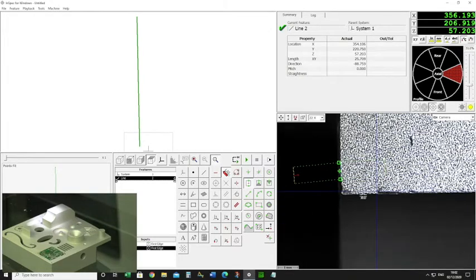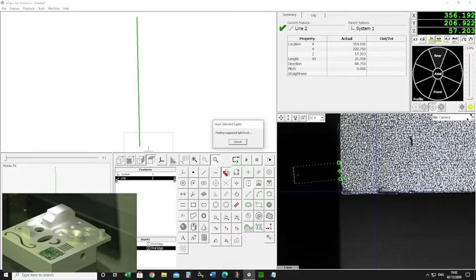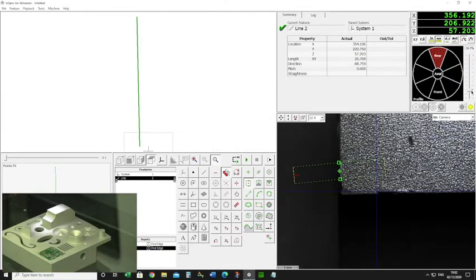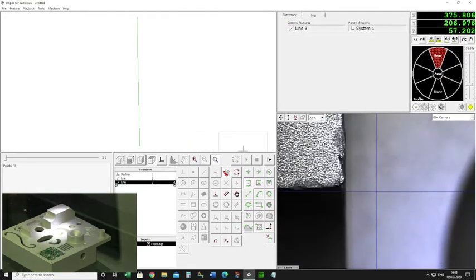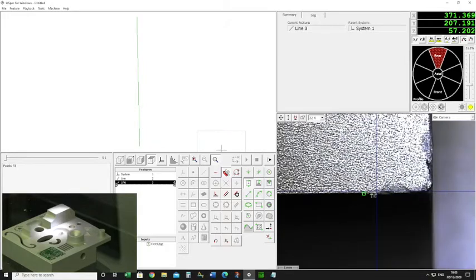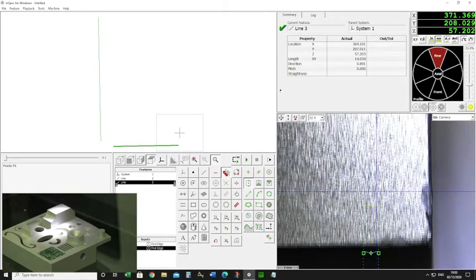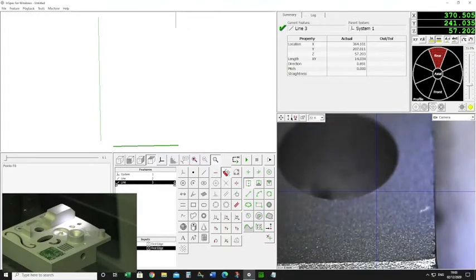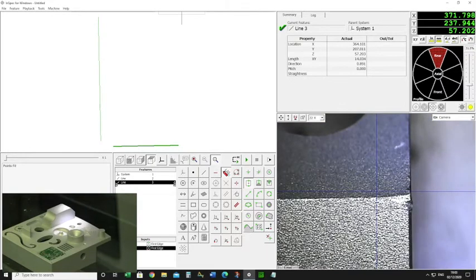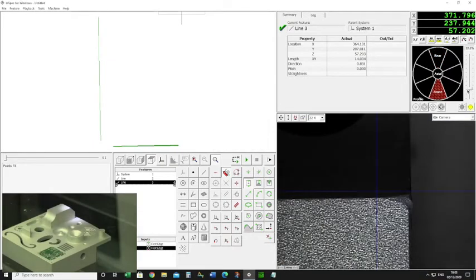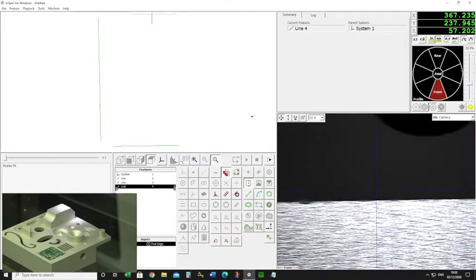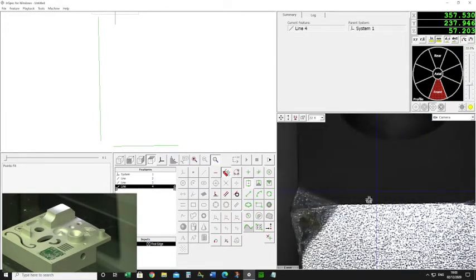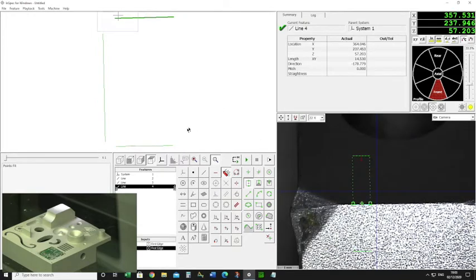I'm also going to measure a line here, so I might just change the lighting up a little bit. I've got two lines now, and I can do the same at this edge. You can see here this is where the surface changes, so I'm just going to change my lighting to get a nice contrast on the edge I need to measure. I've just gone round and measured three lines.